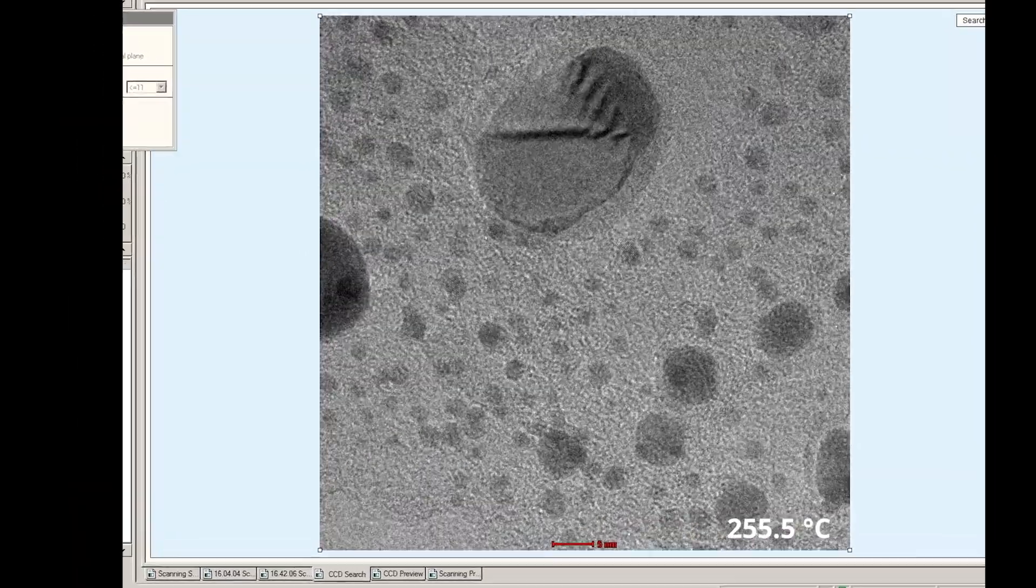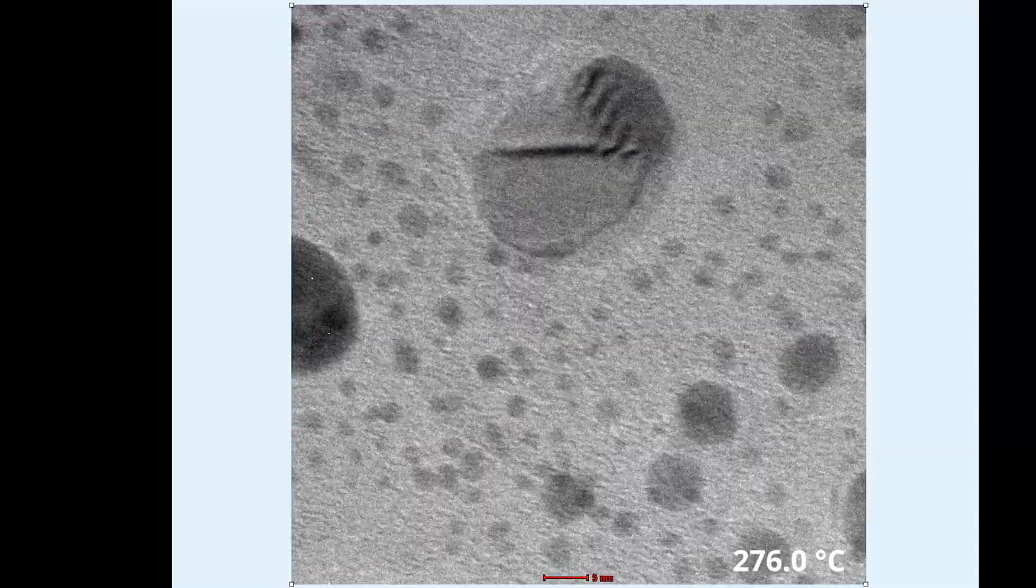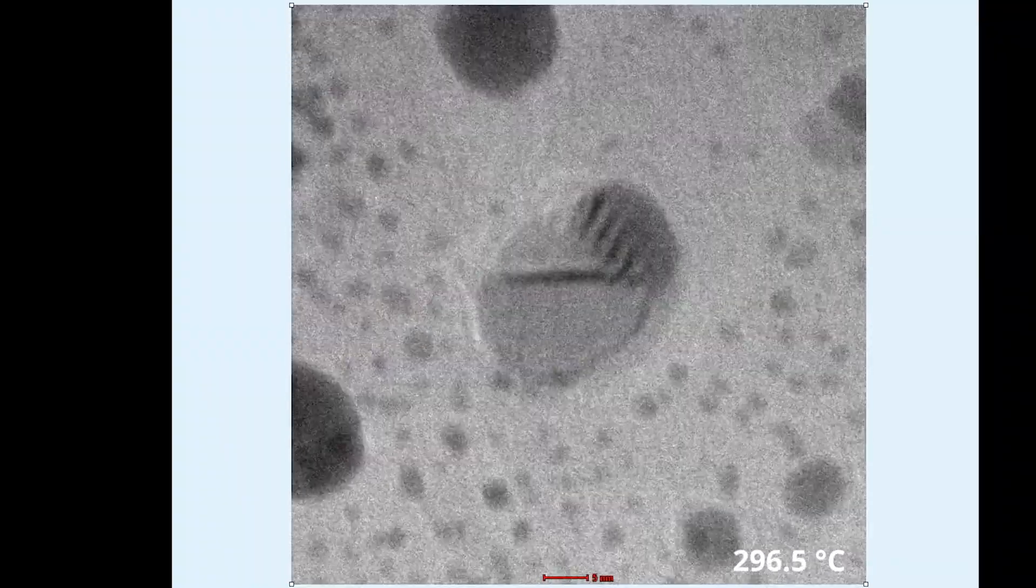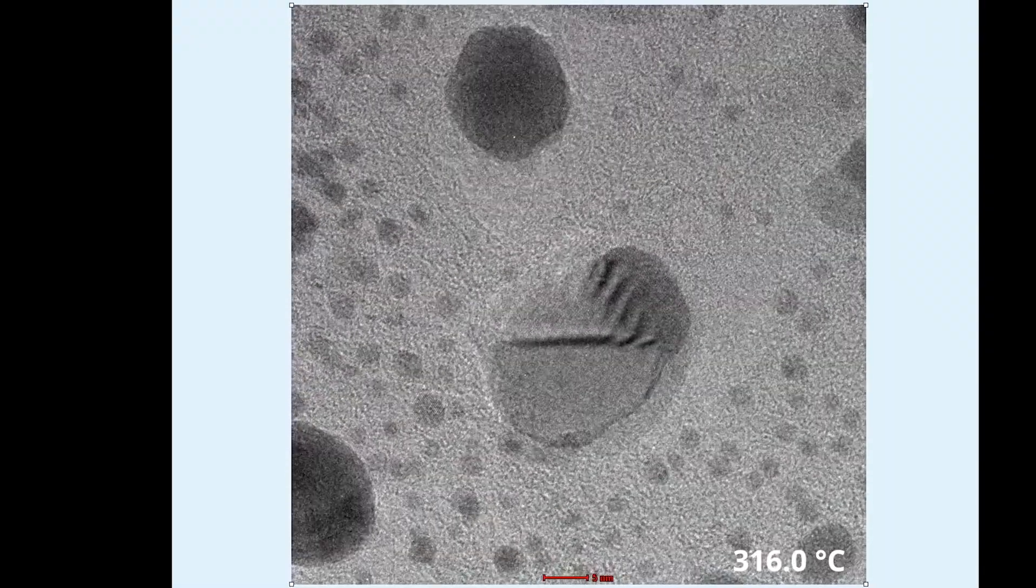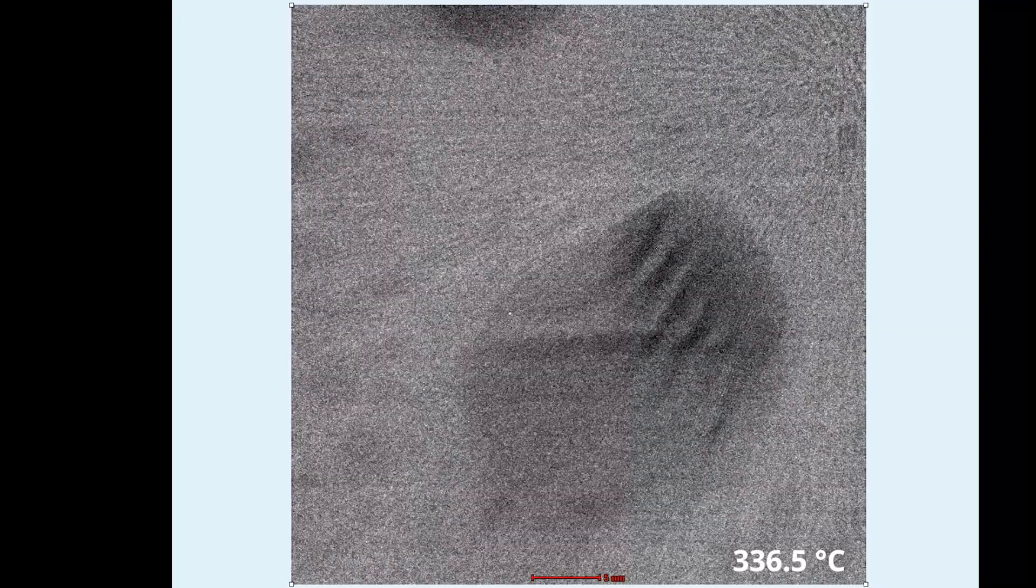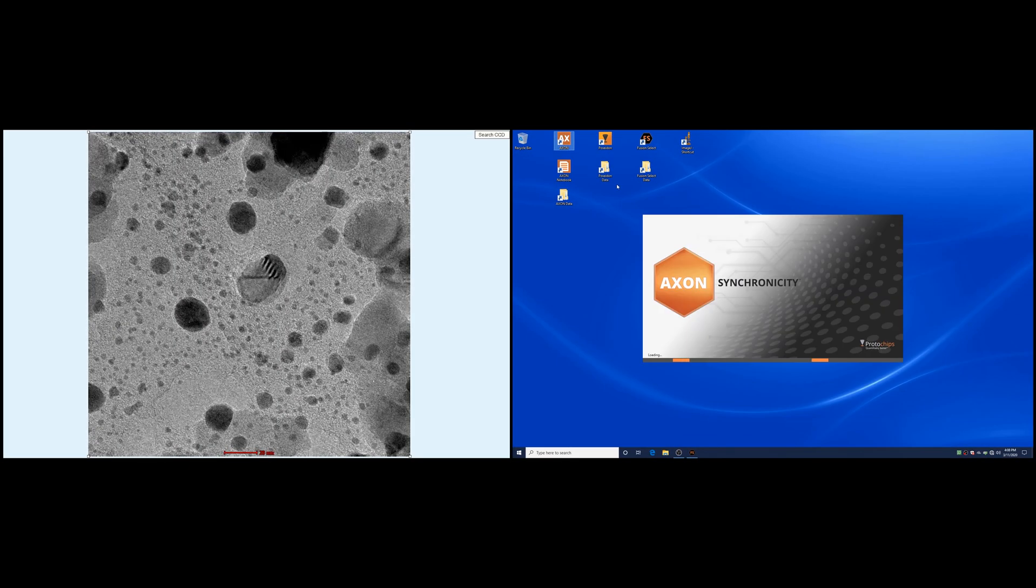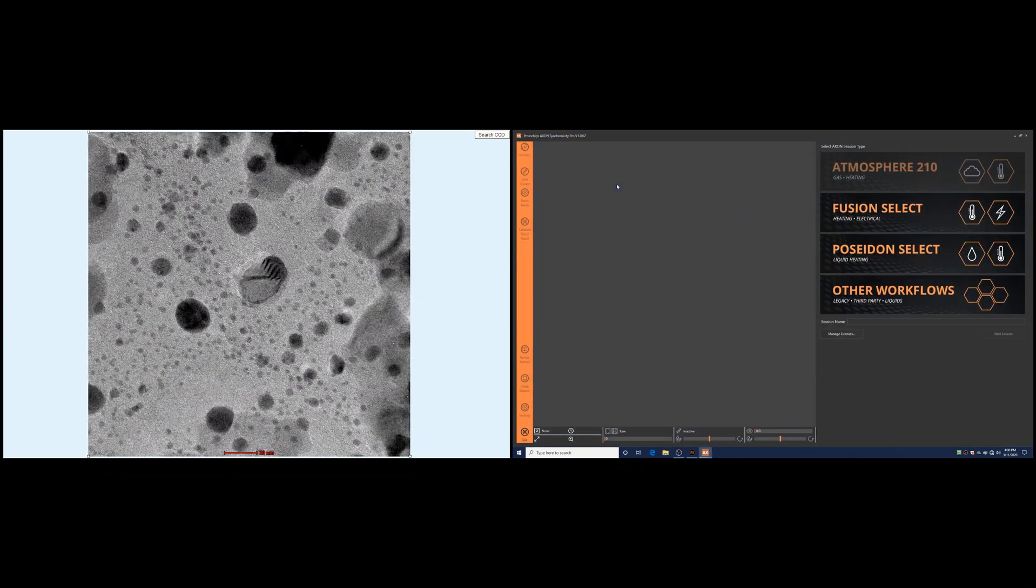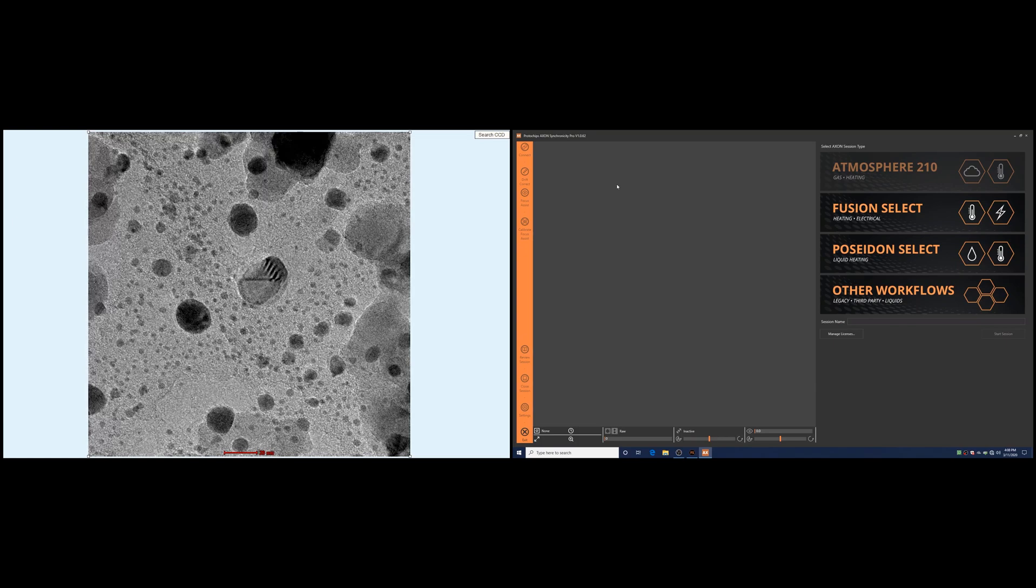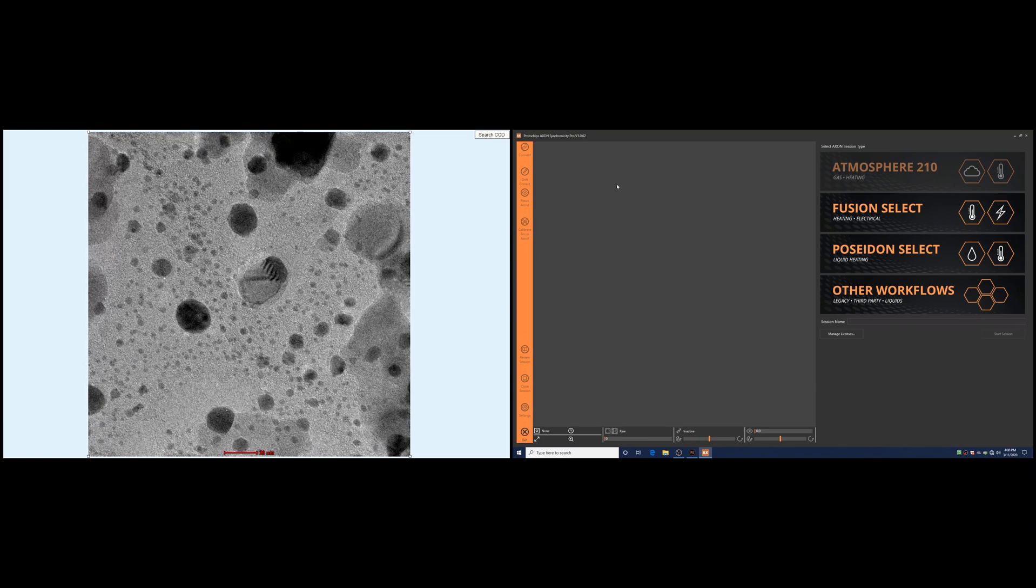Specimen instability is an unavoidable reality in TEM operation. Not only does it increase the difficulty of performing your experiment, but this instability ultimately limits the level of performance you can achieve. This effect is amplified when stimuli such as heating or cooling are applied to the sample in more advanced in situ work. Let's have a look at how Axon can help overcome instability.